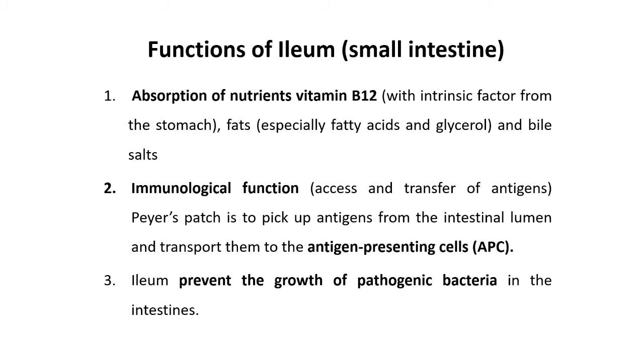So these are the three important functions of small intestine, that is ileum. So first one, absorption of nutrients, like fatty acids and glycerol along with vitamin B12. Second function, that is Peyer's patch function. Peyer's patches are immunological in function.